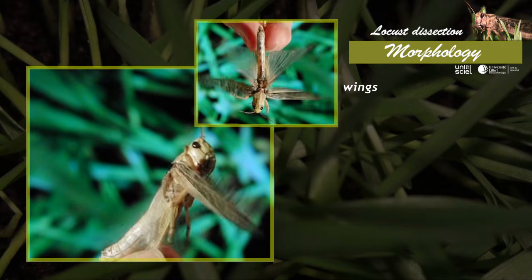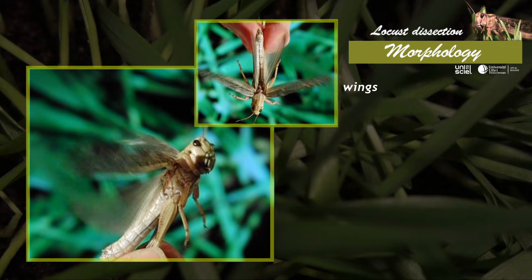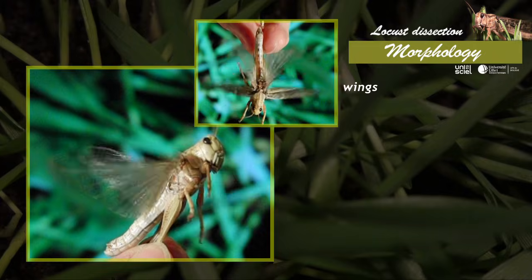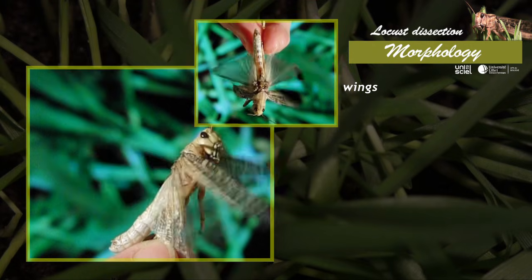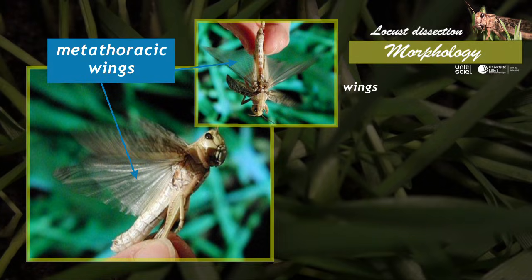Each of the 2 posterior segments of the thorax bears a pair of wings. The forewings are sclerotized and are called tegmina or elytra. The hind wings are larger and membranous.